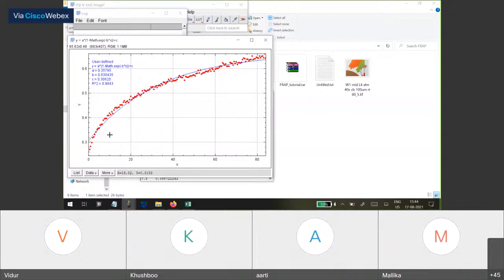It just so happens that it's not the best fitting here. You can see that there are structural errors. It's not completely random across the data because my data suggests that there is a 2 exponential fitting here. But this is a raw thing that everyone can try on their own data set.